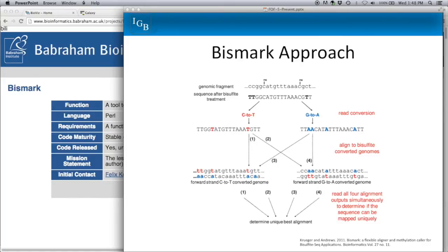Unlike previous tutorials, I'm not actually going to be running Bismark through Galaxy today. It is currently available as a tool on the Galaxy toolshed, but it's an unverified tool, so it's not yet available through the normal Galaxy interface. If you want to run Bismark, you'll most likely need to run it through the command line. The documentation is very good and easy to follow. I've already run some example data from the Sequence Read Archive through Bismark, and I want to briefly go through the steps involved so you understand the general approach and the output we can visualize in IGB.